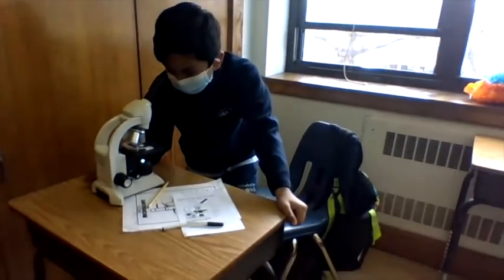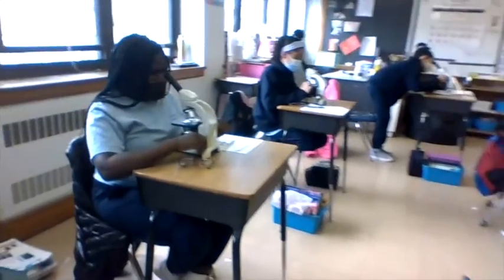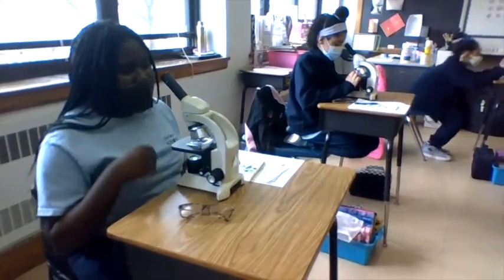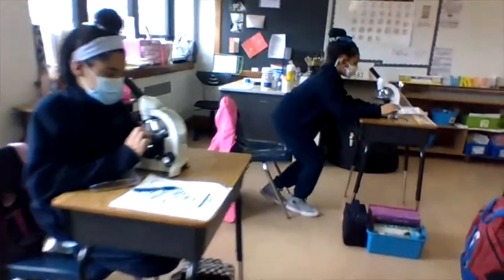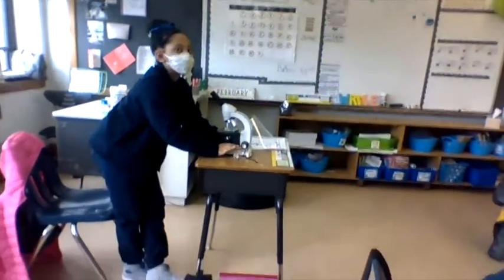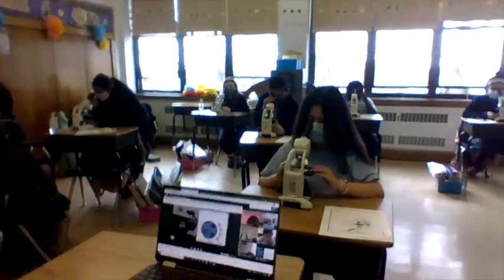What do you notice? Or what do you observe? Cracks in between? Cool. Layla, what do you see? It looks like little bamboo sticks, and I can also see the vein. Cool. It's really nice. Did you get it yet, Sia? Okay, keep trying, right? Use your knobs. Oh, and I'm like the corner of mine. It's so pretty, right? Great job.